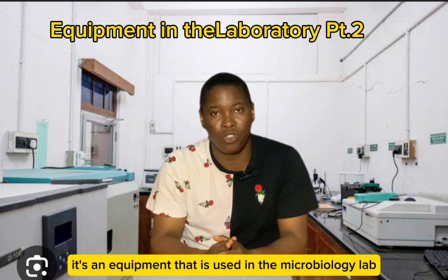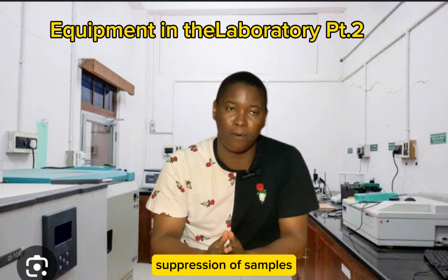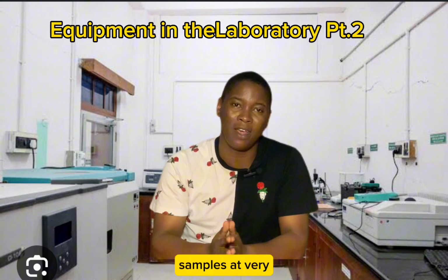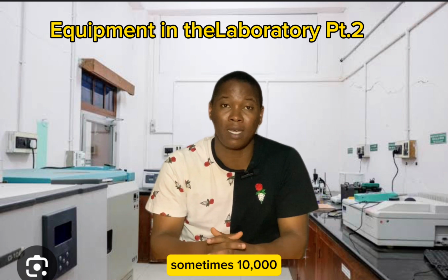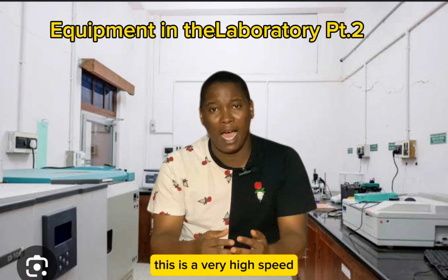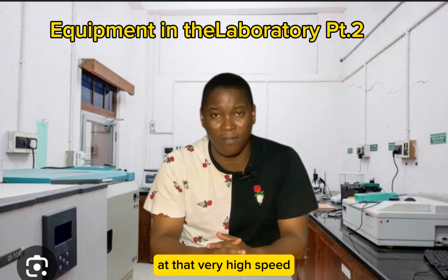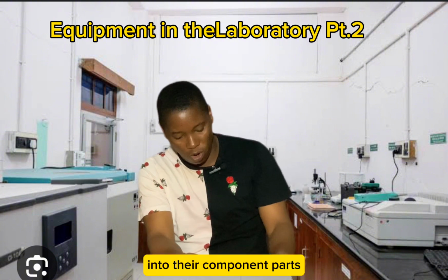It's an equipment that is used in the microbiology lab to bring about separation of samples, and it spins samples at very, very high speed, sometimes 1,000, sometimes 5,000, sometimes 10,000 revolutions per minute. So this is a very high speed, and when it has spun those samples at that very high speed, it helps to separate the samples into their component parts.